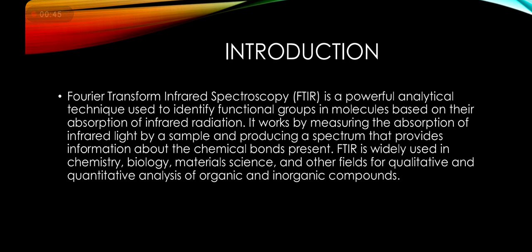It works by measuring the absorption of infrared light by a sample and producing a spectrum that provides information about the chemical bonds present. FTIR is widely used in chemistry, biology, material science, and other fields for qualitative and quantitative analysis of organic and inorganic compounds.